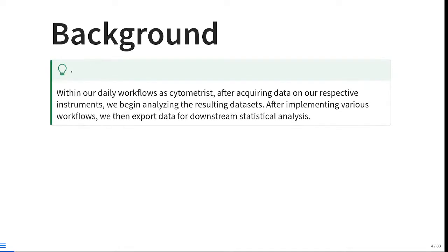For a little bit of background about why this is such an exciting thing to encounter, let's think of our daily workflows as flow cytometrists. After putting all that effort into building your panel and acquiring the data on our different instruments, we need to take them back to the lab where we start working on our gating schemes. We set up our gates for every cell population that we're interested in, and at a certain point in our workflow, we need to export the data from those gates that we drew, and then take that data and start doing downstream statistical analysis with it.